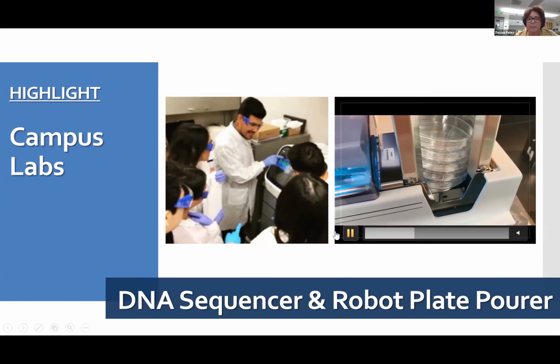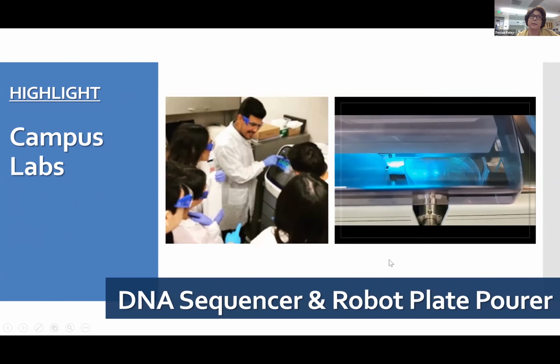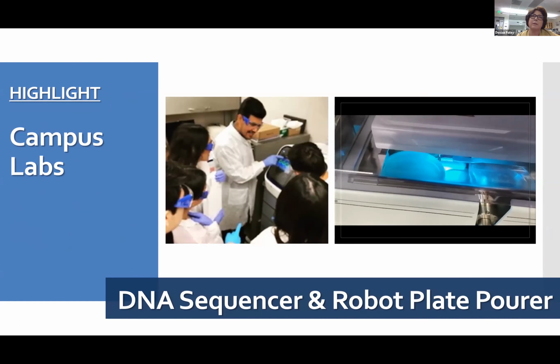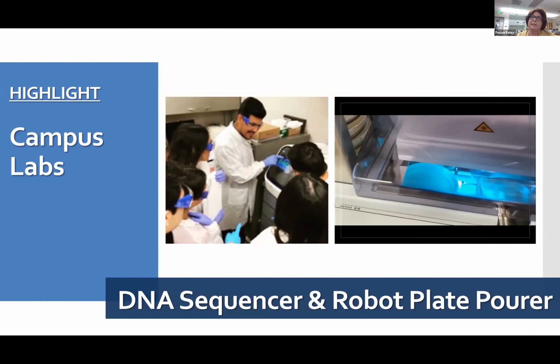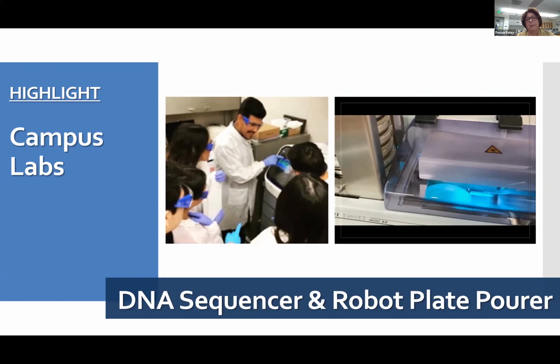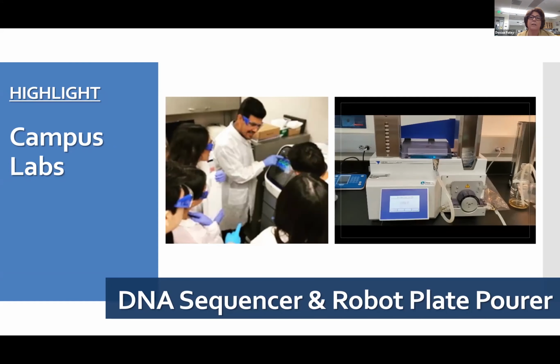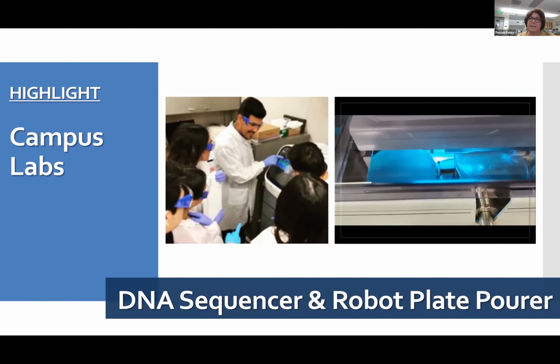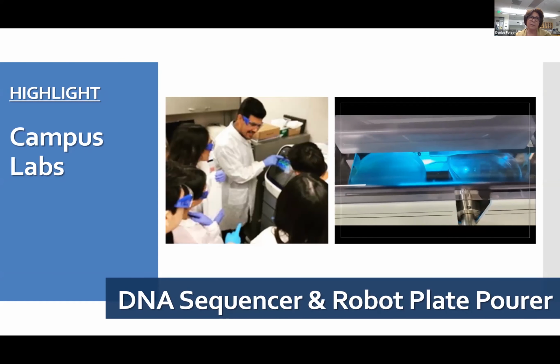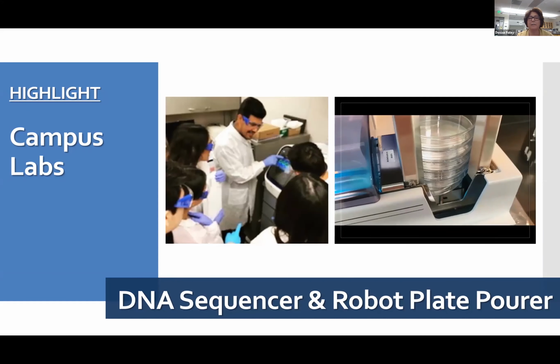On the other panel, we have students working with our DNA sequencer. Both of these are newer items that we have in our program. The DNA sequencer is probably the newest, and because we have an expert on nucleic acids, that professor is able to show students how to sequence DNA and actually determine the order of letters on a given piece of DNA, which is quite amazing. And I should reiterate that these items of equipment are better than most universities have in their labs.